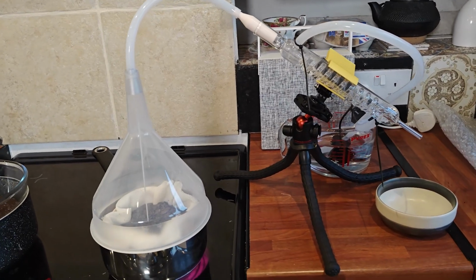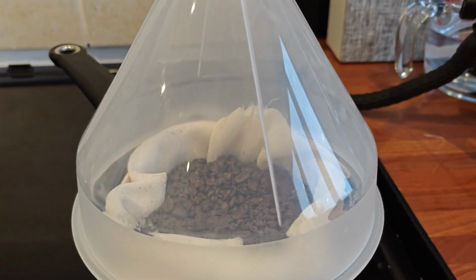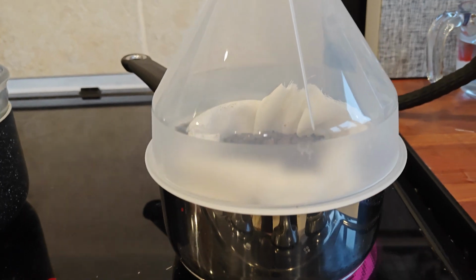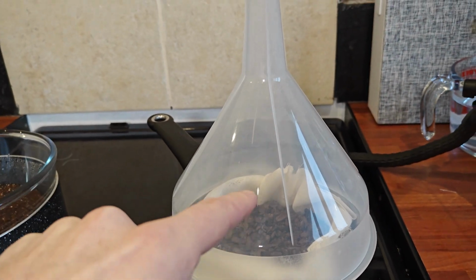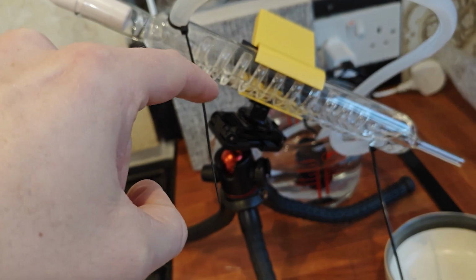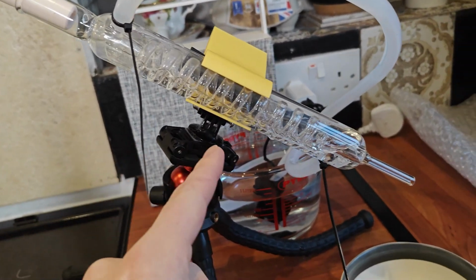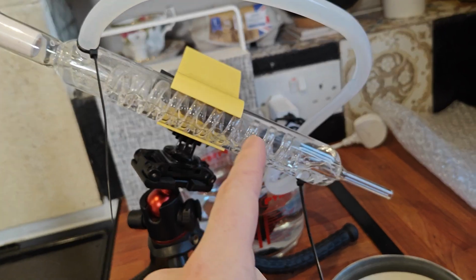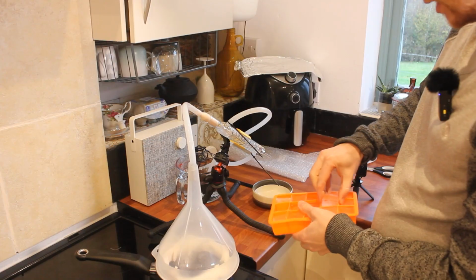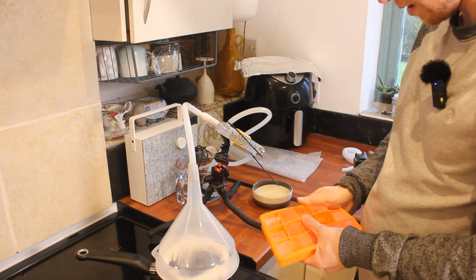The whole of the steam distillation is set up. So here we have the coffee that's being heated and steamed. The steam should hopefully rise up, go inside the condenser, around the spiral tube, and then this cold water should cool down the steam back to a liquid, and then we collect it in this bowl to finish. So it's set up, ready to go. The finishing touch is to just add the ice.